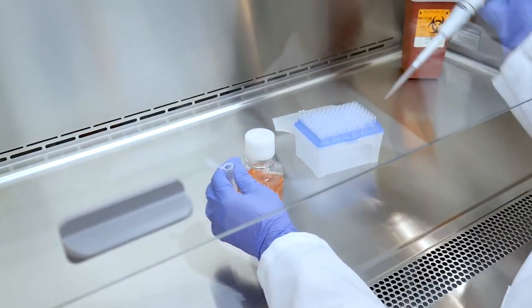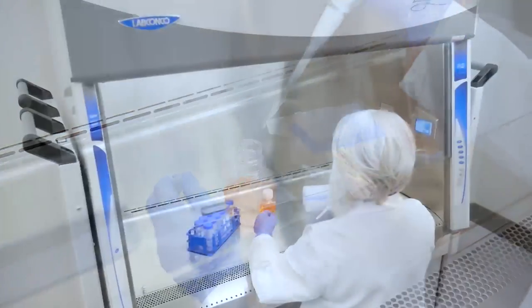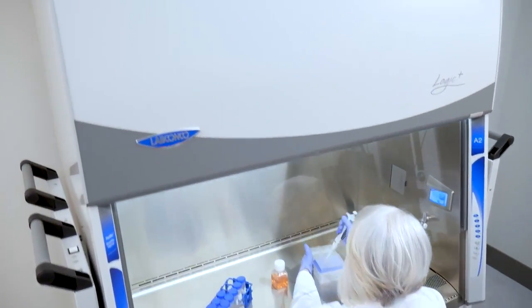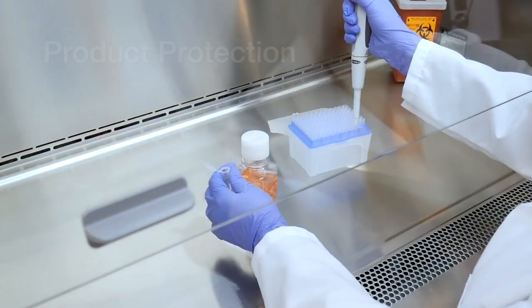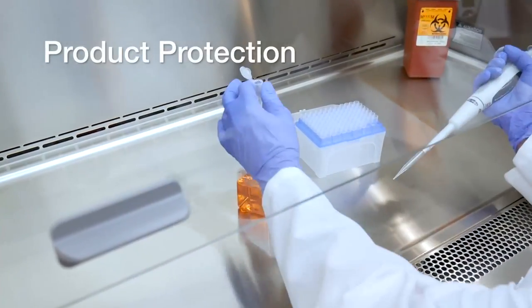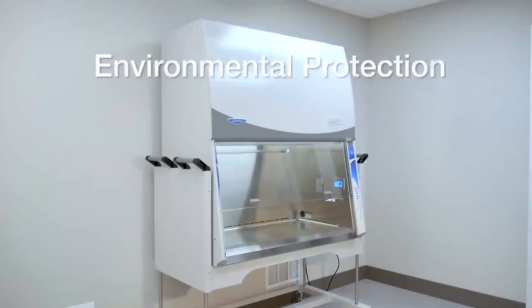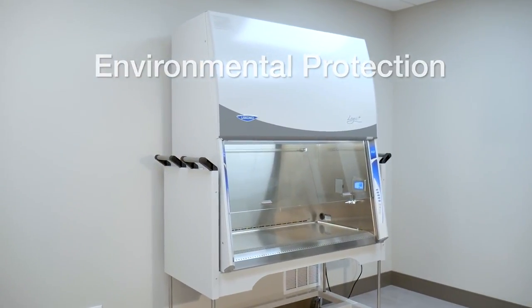Next, contaminated air captured from the cabinet interior and room is filtered and then recirculated or exhausted to the room. Any contaminants are filtered providing product protection when recirculated and environmental protection when exhausted out of the cabinet.